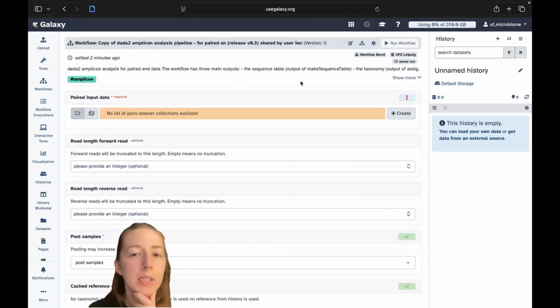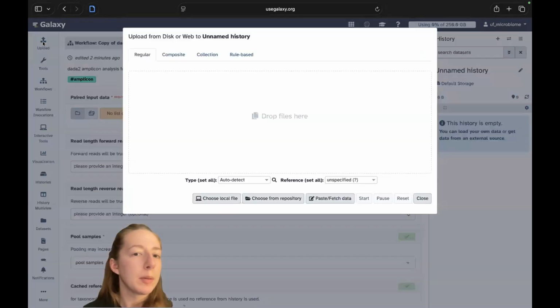Okay, so this is what it looks like when we want to run something. However, we need to first upload. So I'm going to go ahead and choose a local file.